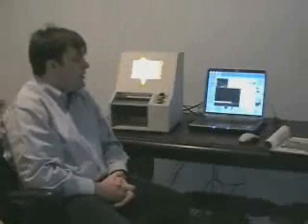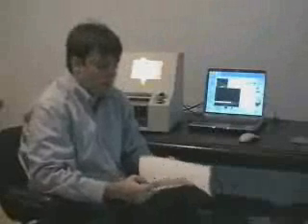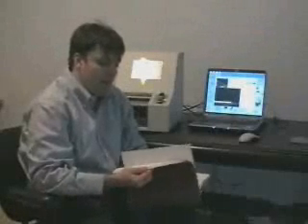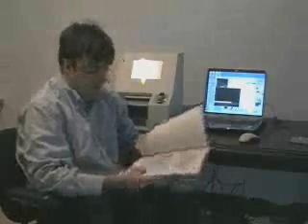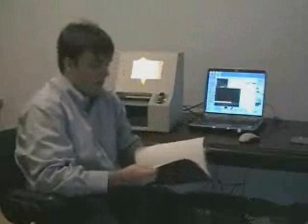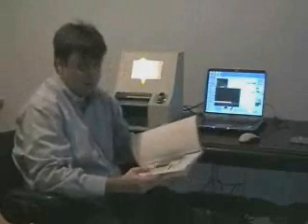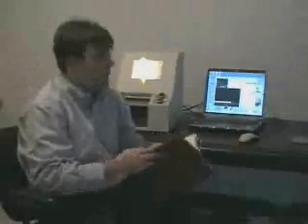You will see on the Pillgrade screen the entire layout of the main screen. This is the only screen that you will be using in day-to-day use. All of the details for that main screen are described in great detail on page 10, and in further detail on page 12.